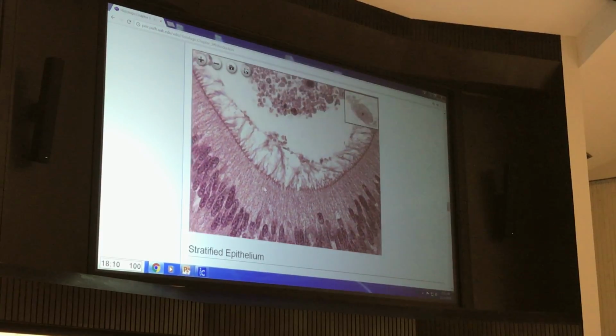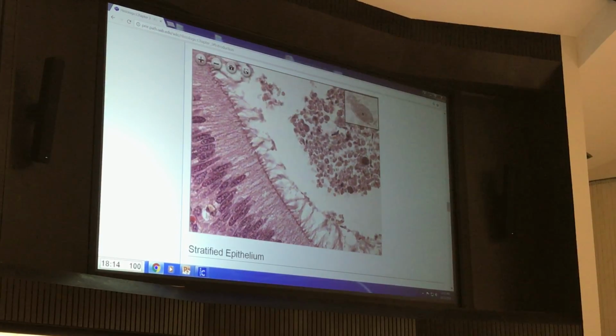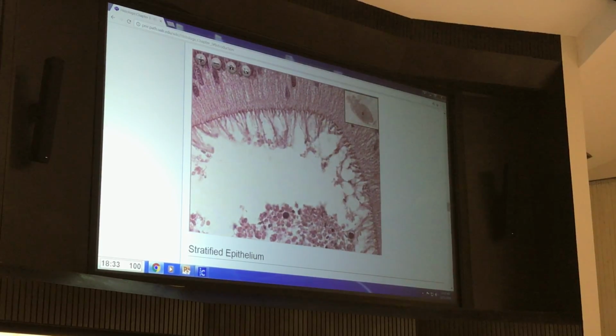And what are we finding? What are we seeing here? Do these look different than the structures we just saw? Yes, no? Those cilia were very regular, like blunt bristles. These are long and stringy. Stereocilia. These are stereocilia. Different heights, and what's at the core of stereocilia?